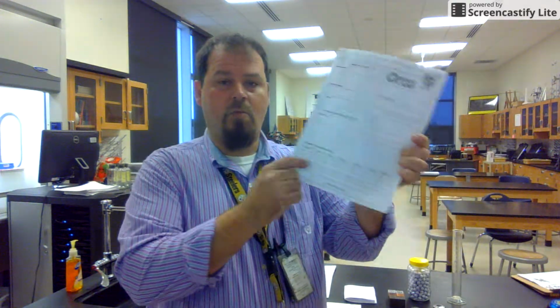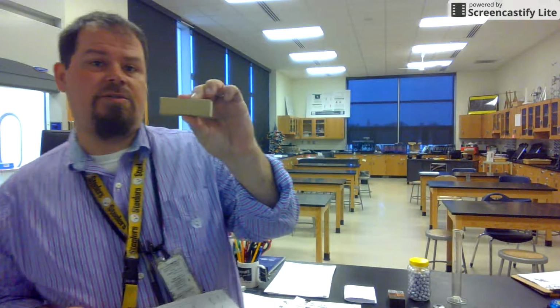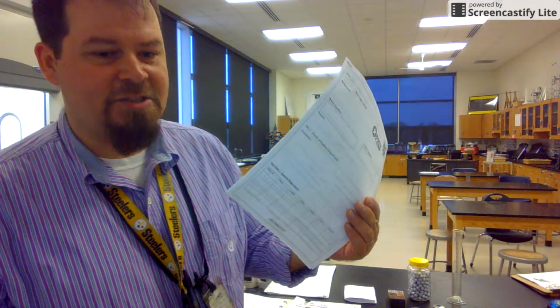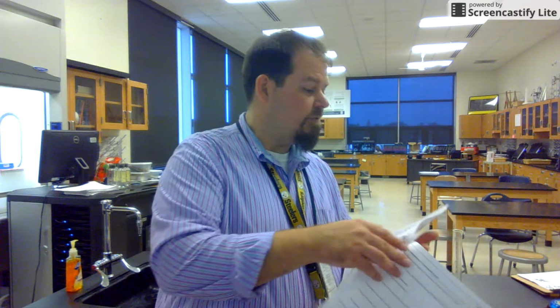Now, this is what I want to happen here. This object number 1, 2, 3, and 4, I don't want that to be object number 1, 2, 3, and 4. What I want is everybody in your group to do this once, do it yourself, and then average the 3 together, okay? Notice there's a deviation from what I said to what's on the paper. I'm going to find out that way if you're listening to the words that are coming out of my mouth, okay?